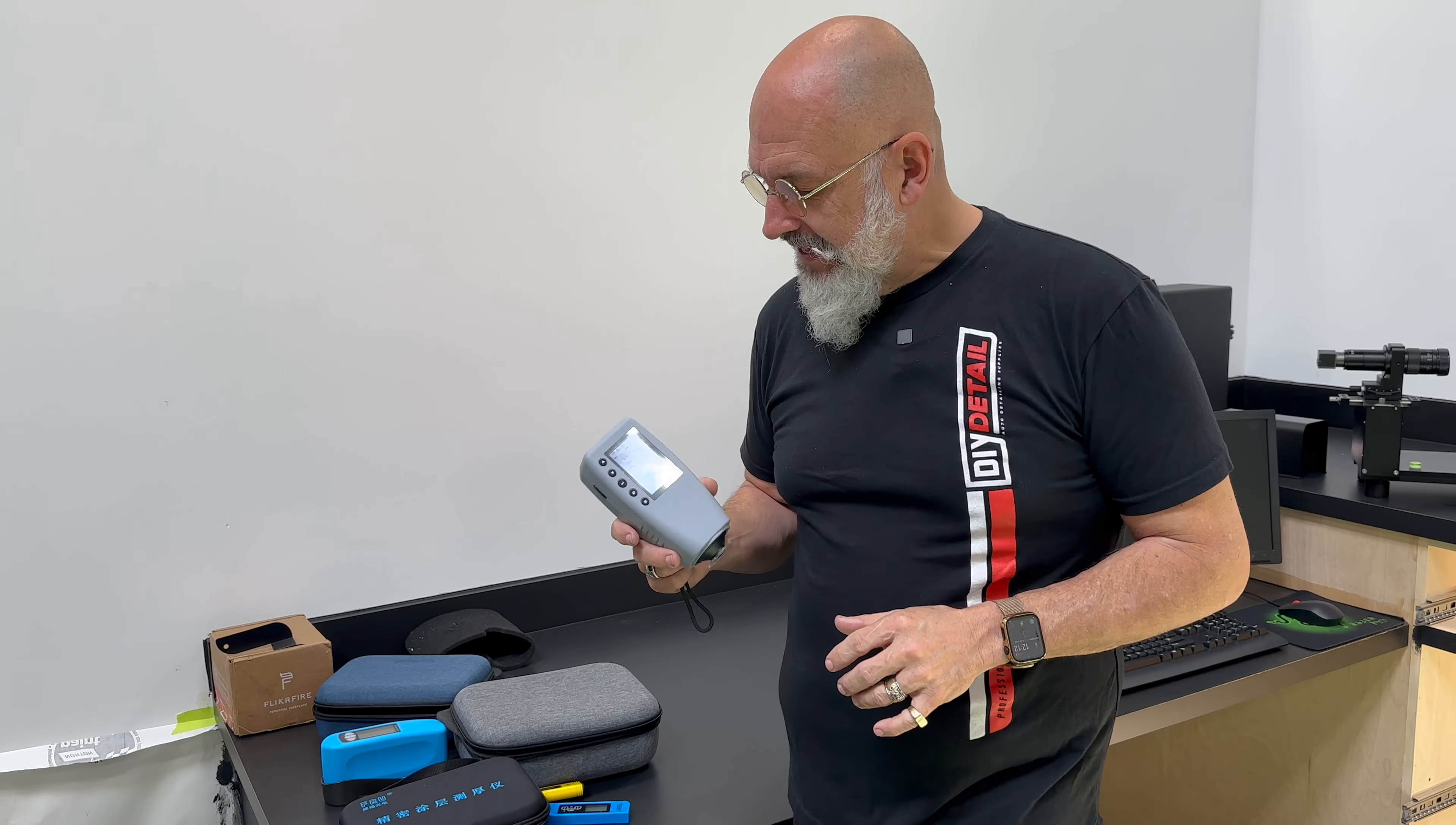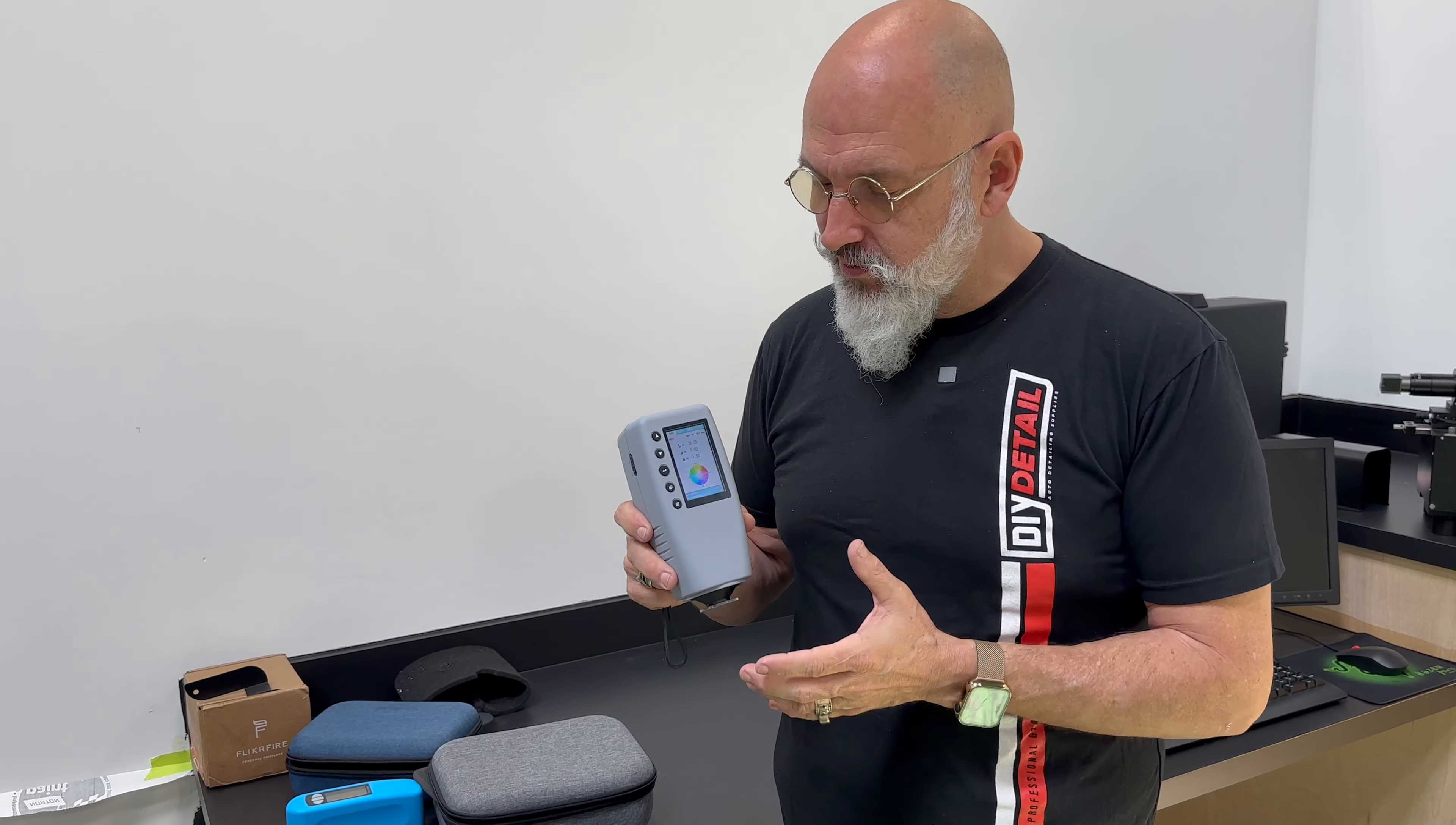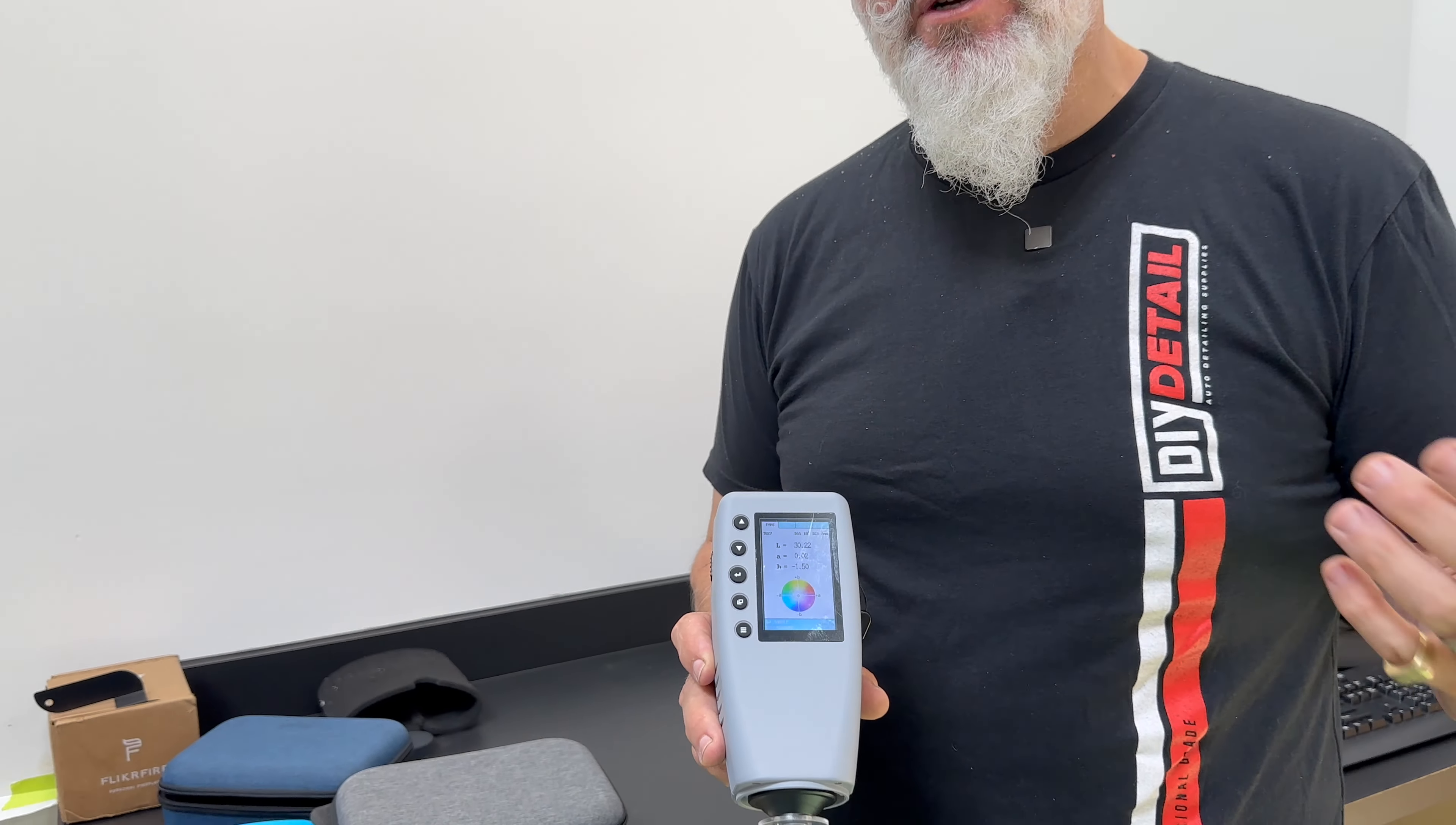A couple of little smaller machines here. This one is for sampling the color. So we want, when you're getting your Incredible Suds, that beautiful deep purple, we want that deep purple to be the same every time. And that's what this does. So it actually takes a reading and gives us what's going on in the color. And then we can make sure that batch to batch, we have exactly the same color specs for you.